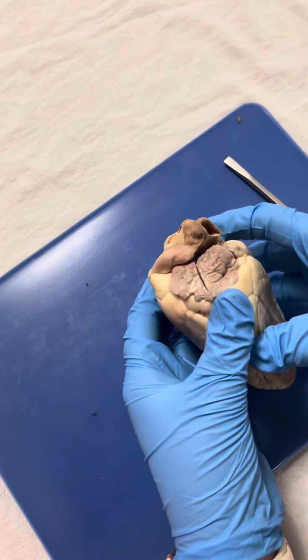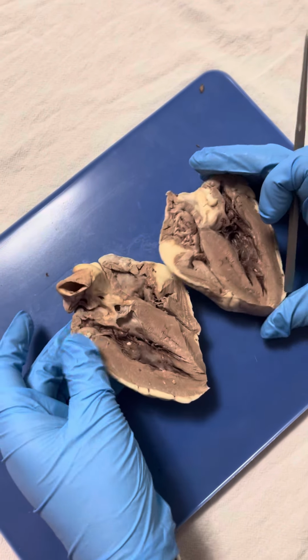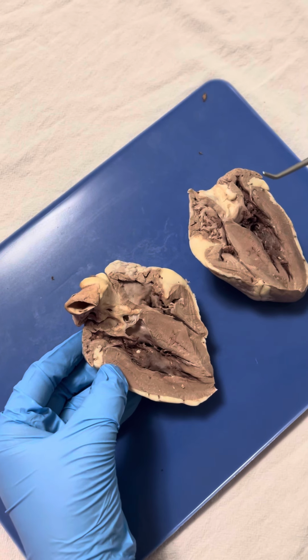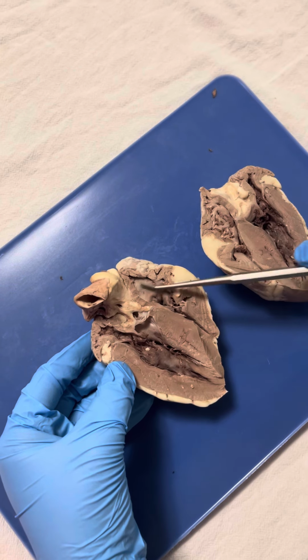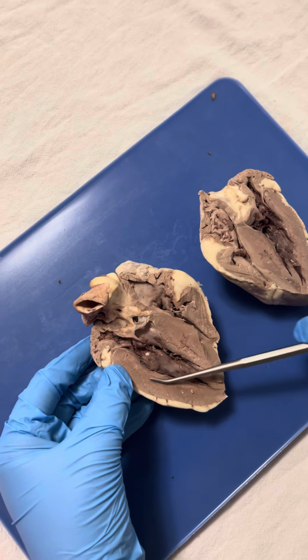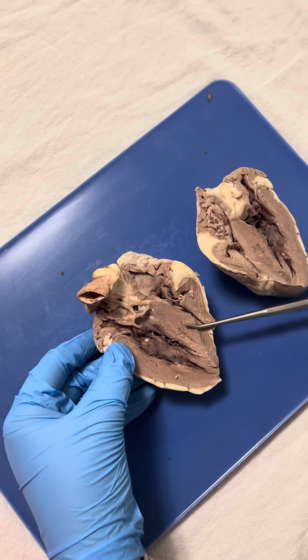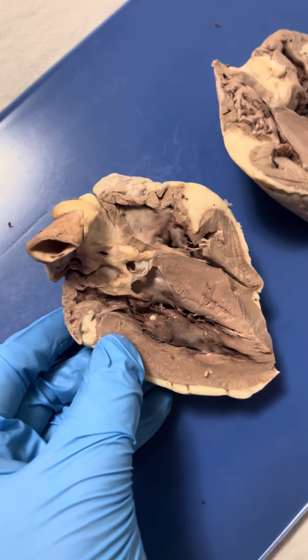So now we're gonna go inside the heart. Internally, we do have a better view of the heart chambers. So here we have the left atrium, right atrium is over here, and this is the left ventricle and right ventricle. And now we're going to talk about the bicuspid and tricuspid valves.